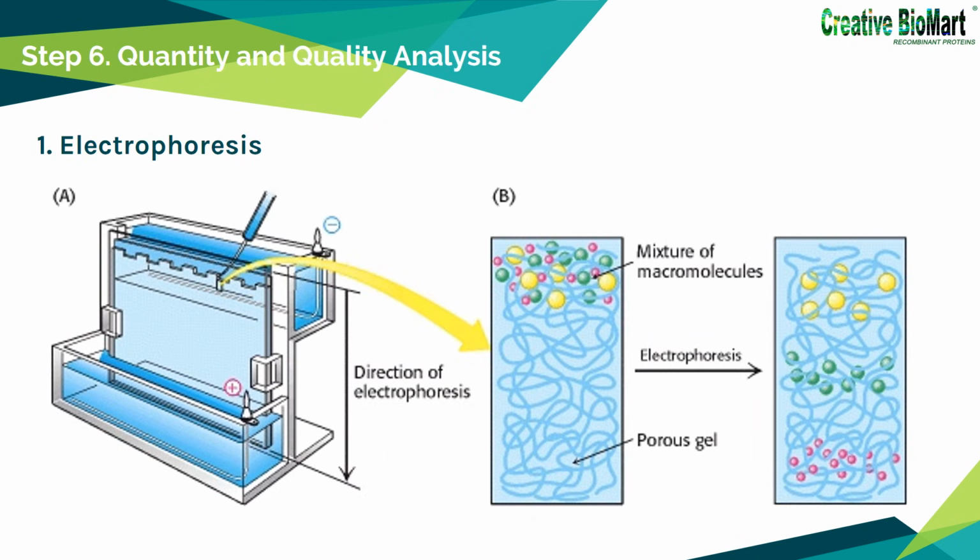After all the purification steps, how could we know our purification scheme is effective? Apart from the specific activity rising in each purification step, another method is using electrophoresis to display the target proteins at each step. Proteins can be separated largely on the basis of mass by electrophoresis in a polyacrylamide gel under denaturing conditions. SDS polyacrylamide gel electrophoresis is rapid, sensitive, and capable of a high degree of resolution. We can examine the efficacy of our purification scheme by analyzing a part of each fraction by SDS-PAGE.